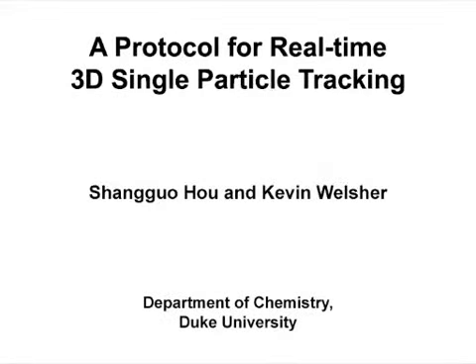The overall goal of this protocol is to implement a real-time 3D single-particle tracking microscope. The main advantage of this technique is that a single diffusing nanoscale object can be monitored continuously with photon-limited temporal resolution. This technique can help answer key questions in the field of virology, such as following a single virion through the entire infection process.